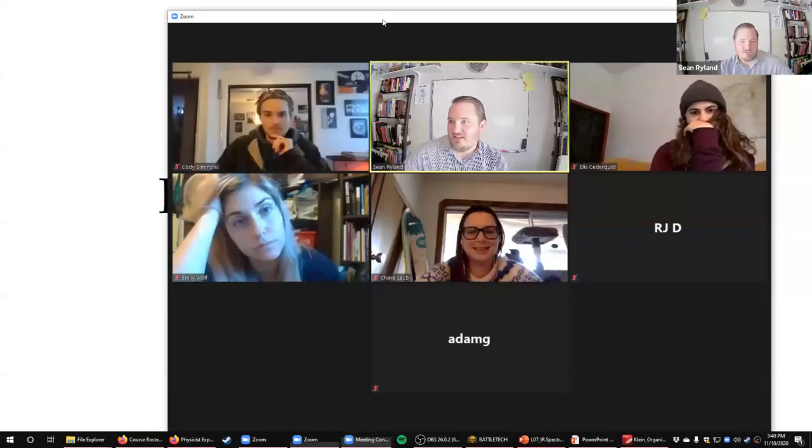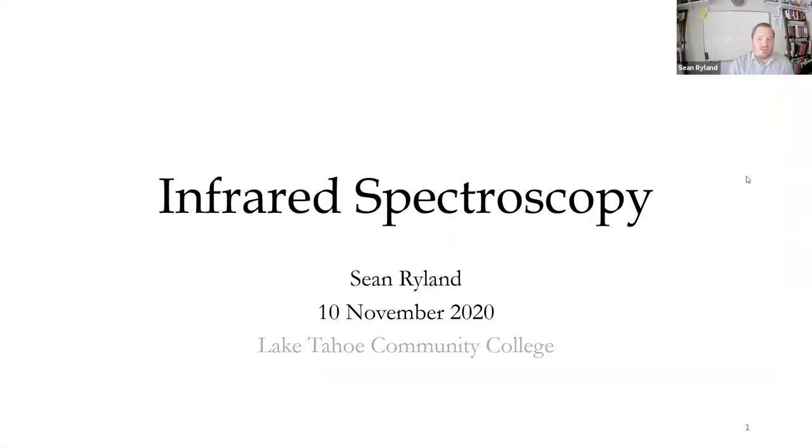But for now, let's go ahead and start talking about IR spectroscopy. And I have, like I said, a little mini lecture just to sort of supplement this. It's one of those instrumental techniques, like I mentioned, like GC, where the actual process of getting the data is actually pretty boring.